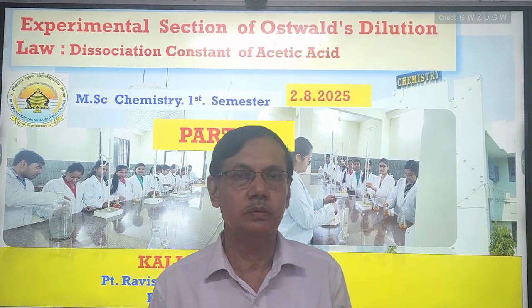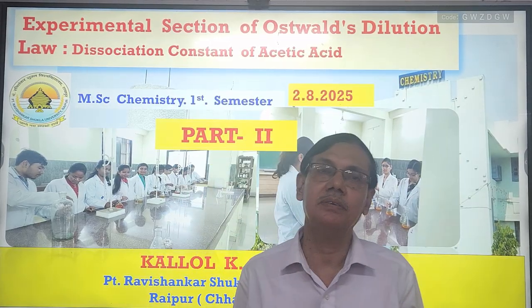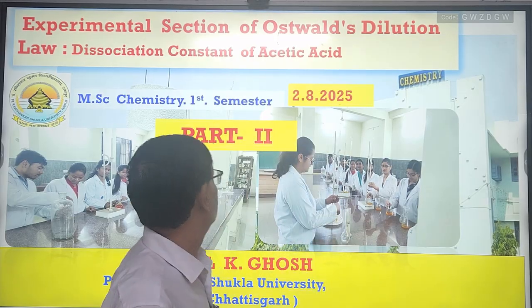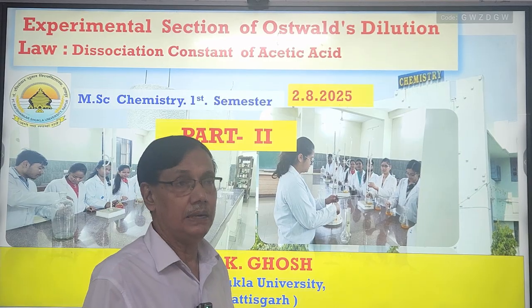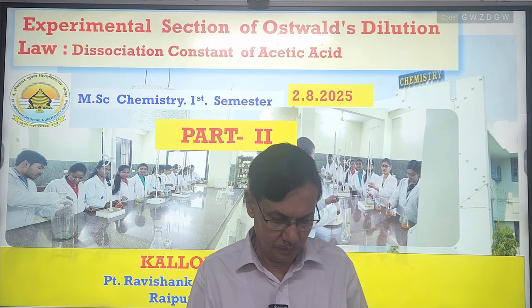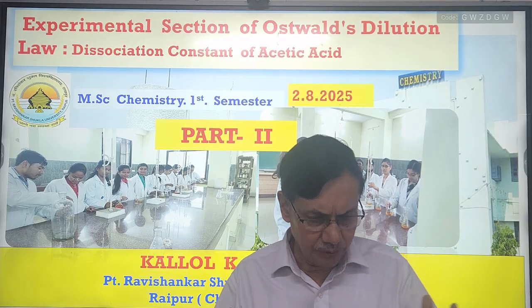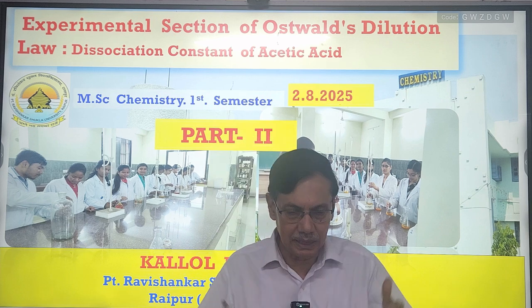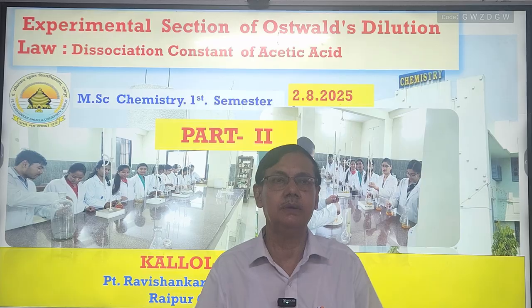Welcome back to the second session of this experimental part. In the first session, I discussed the practical, that is, the verification of Ostwald dilution law and determination of the dissociation constant. In the first section, I discussed what Ostwald dilution law actually is and what the different objectives are.